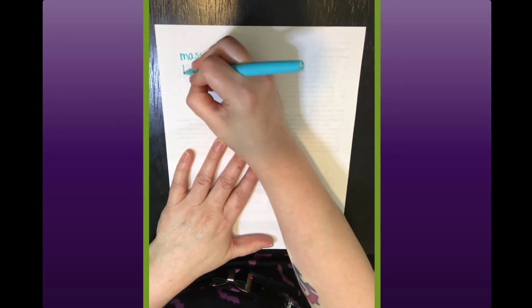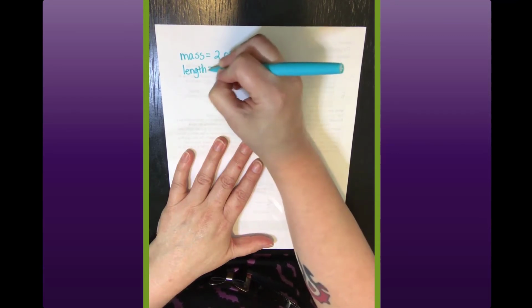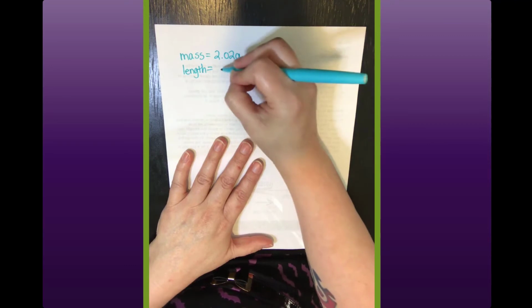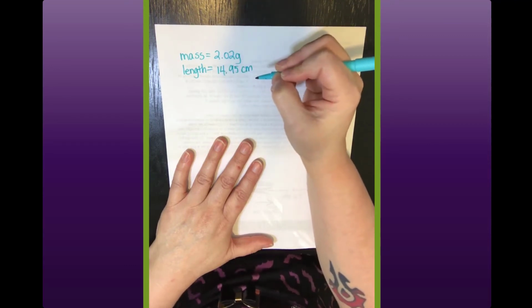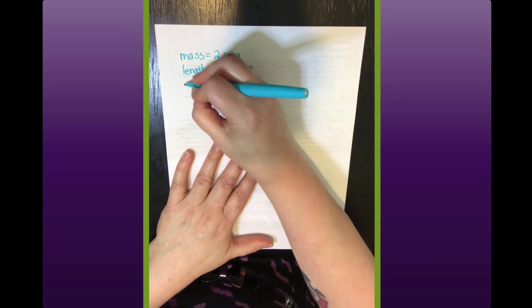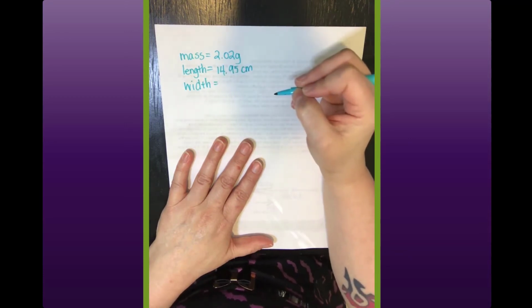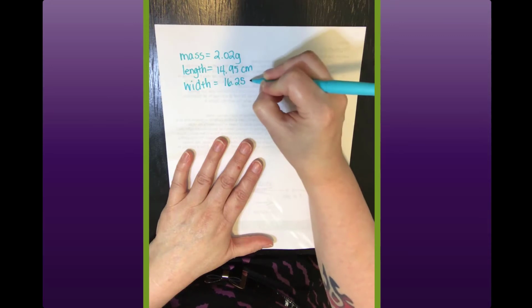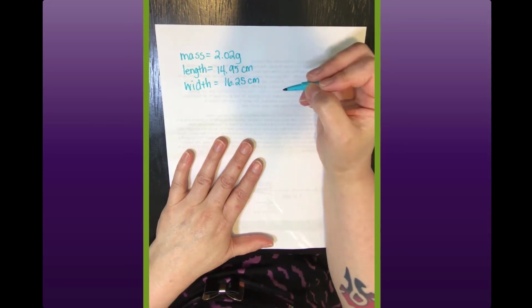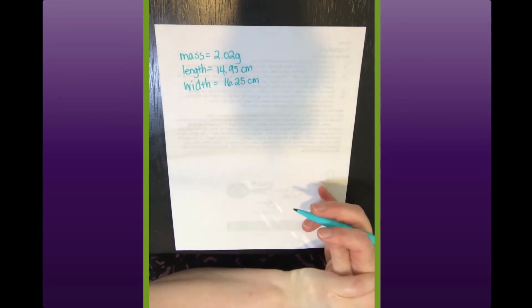And so the length of mine was 14.95 centimeters. And the width of my triangle piece of aluminum foil was 16.25 centimeters. All right, and then it tells us we will use the above information to determine the height or thickness of the triangle aluminum sheet.